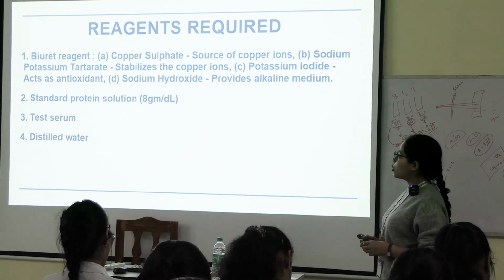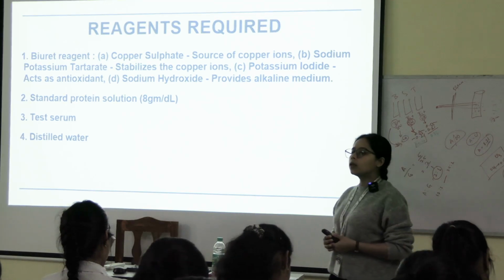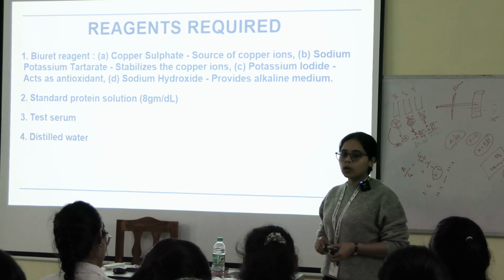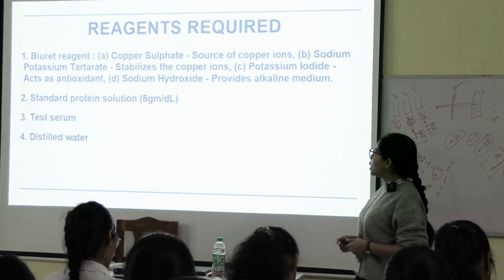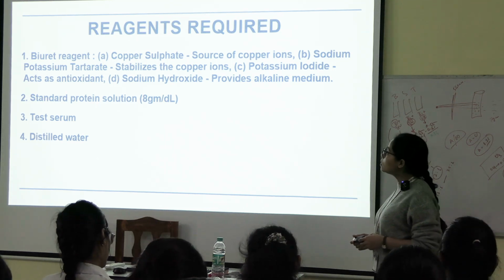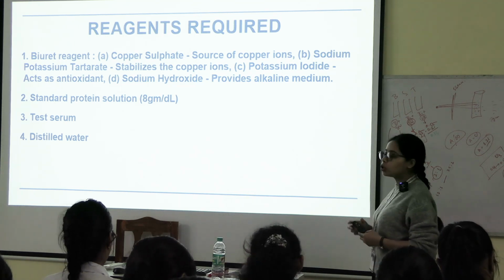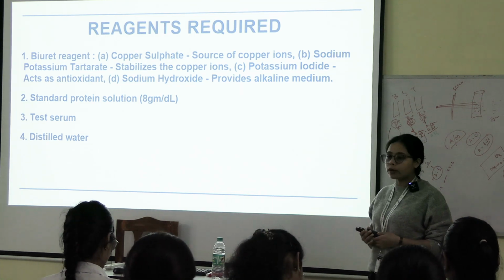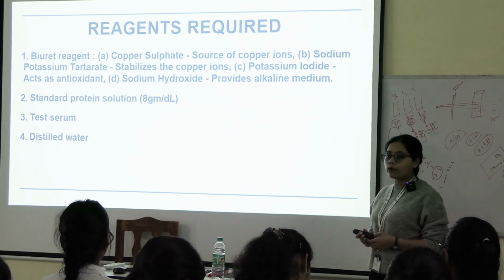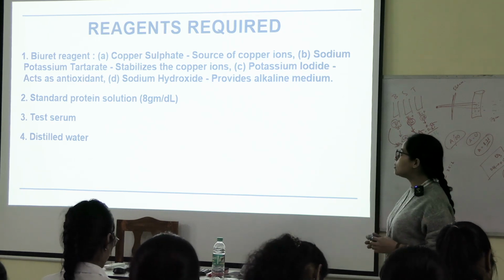Then we have sodium potassium tartrate that stabilizes the copper ions to avoid hyperreaction. Then we have potassium iodide that acts as antioxidant.